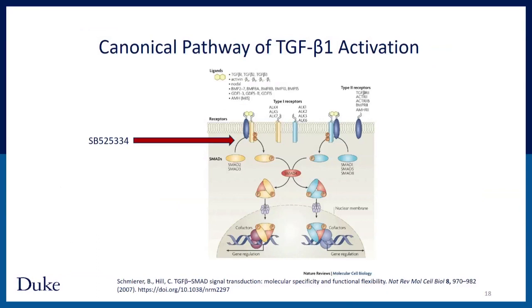We next want to make sure that this is caused by TGF-beta. So we try to block the TGF-beta receptors with this drug, SB525334.